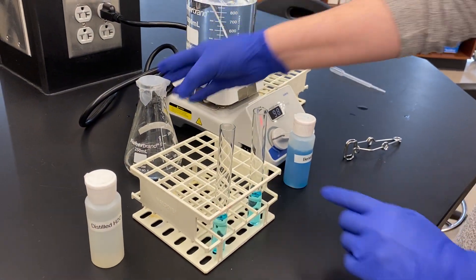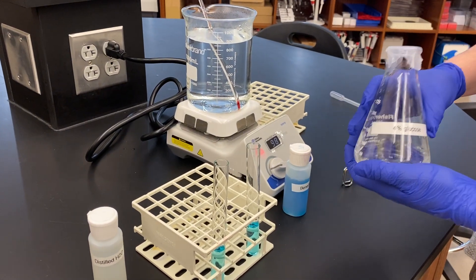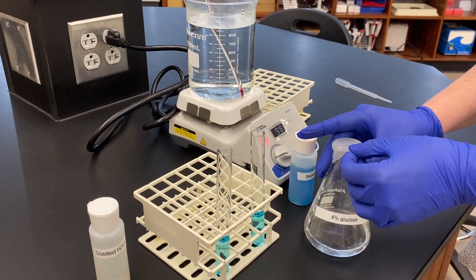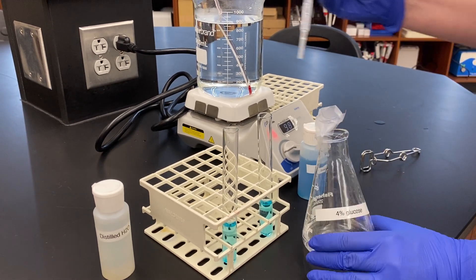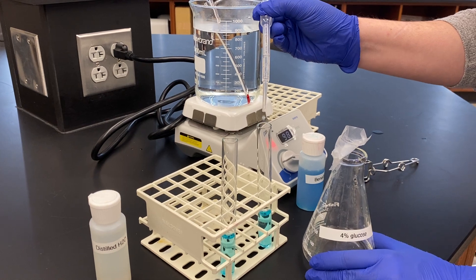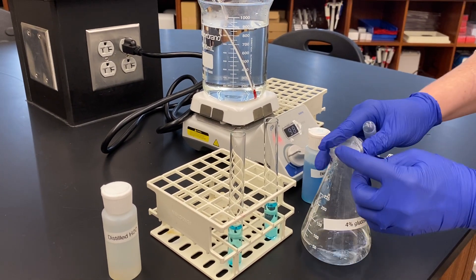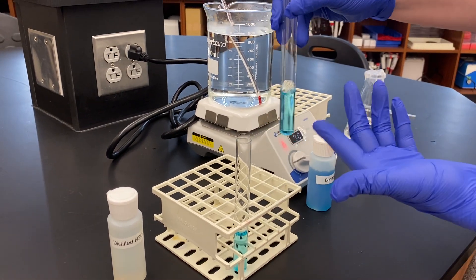My positive control is going to have a sample of something that should react. In this case, we're going to use 4% glucose. I'm going to add 10 drops of 4% glucose. So we have our 10 drops of glucose, and you'll notice right now there's no reaction.